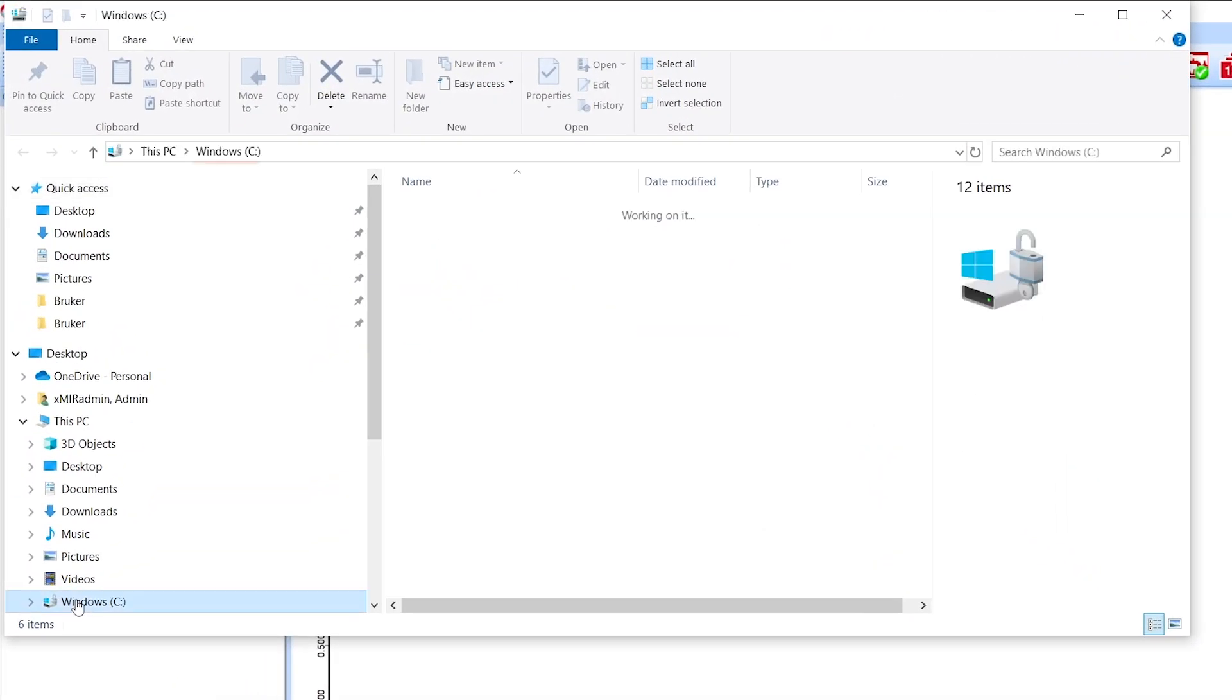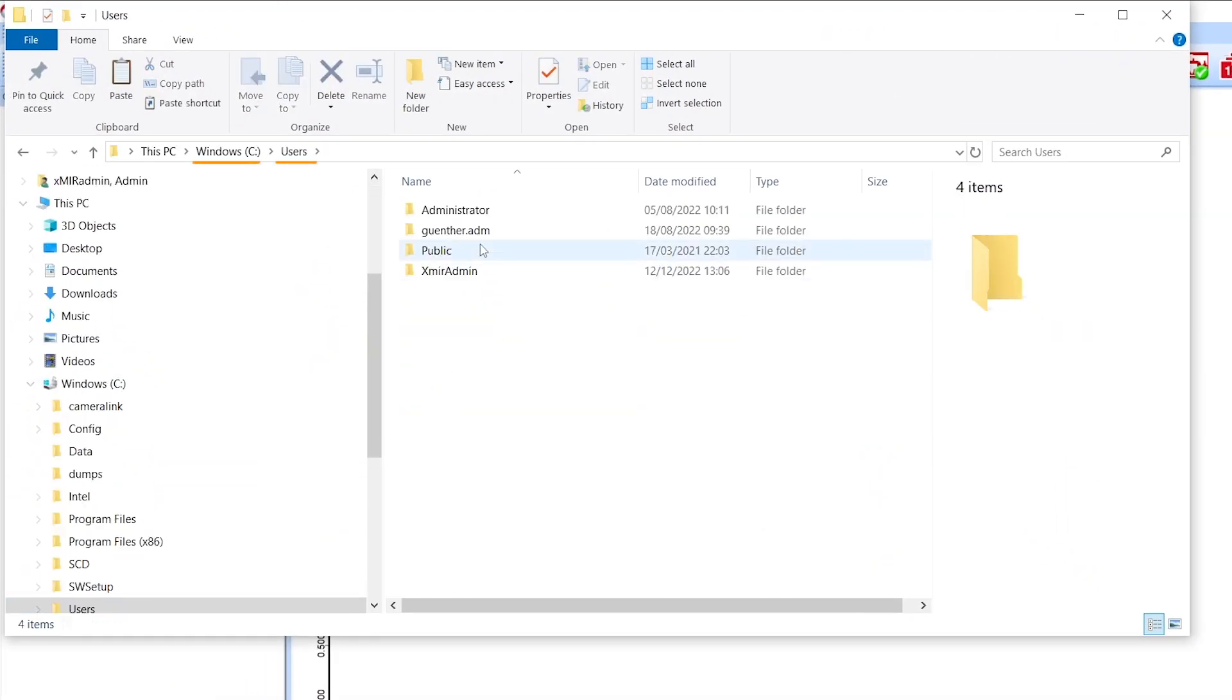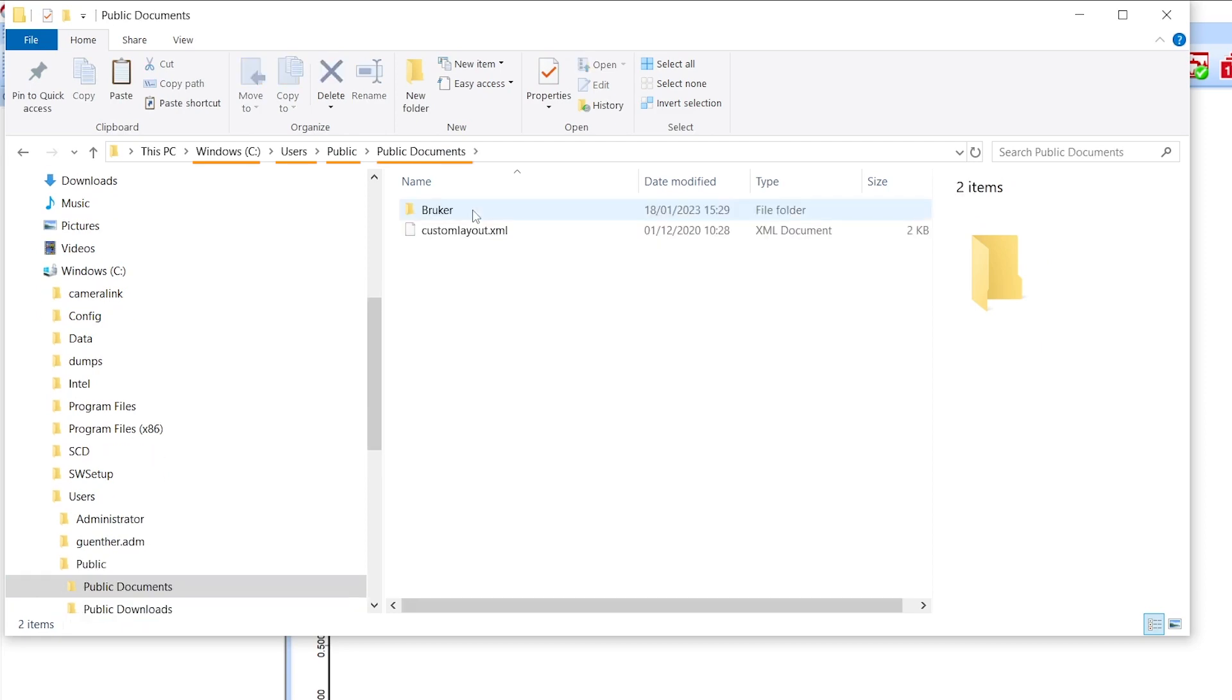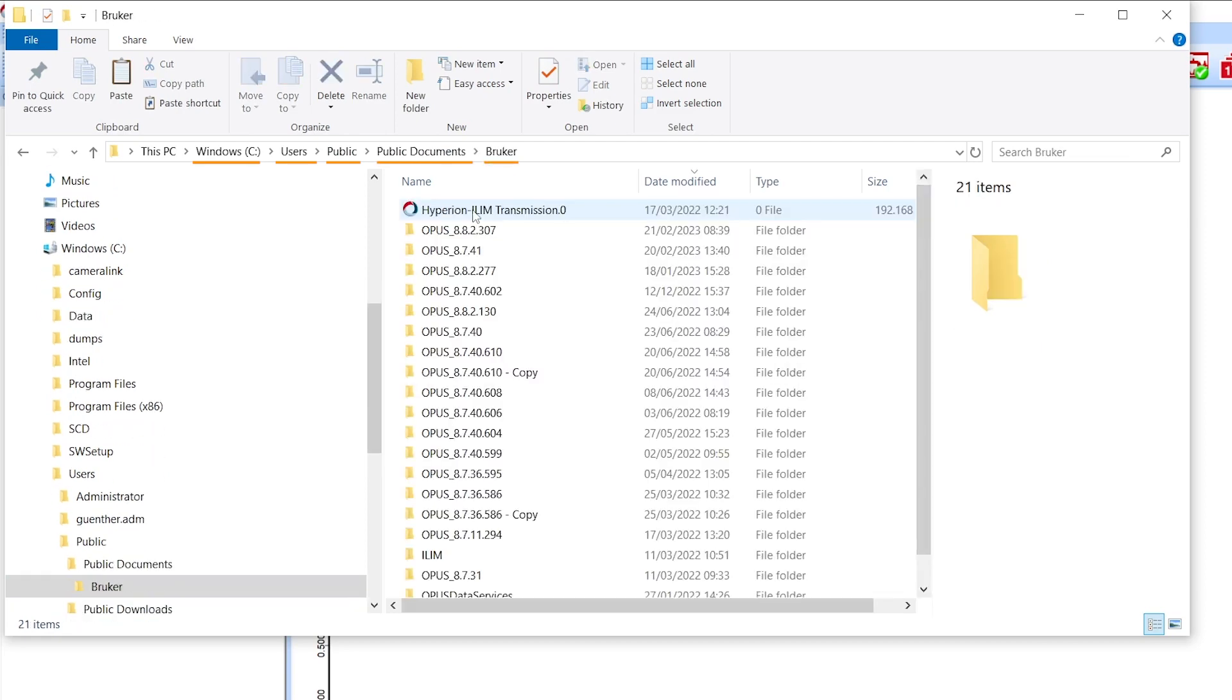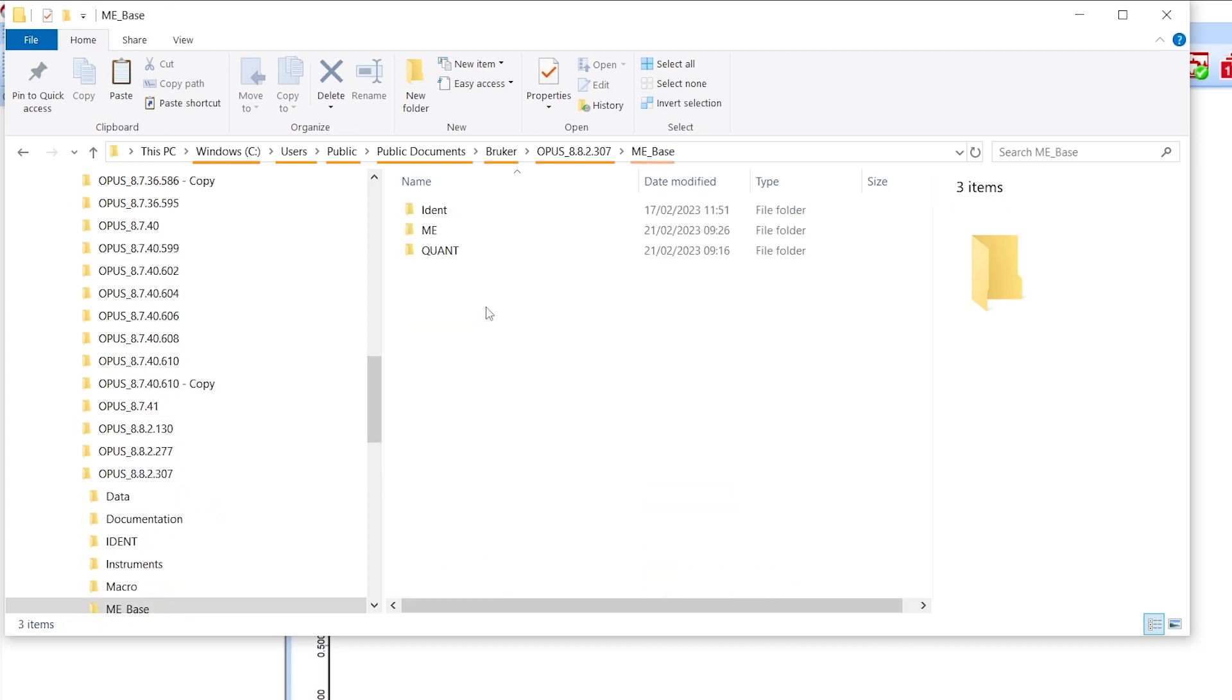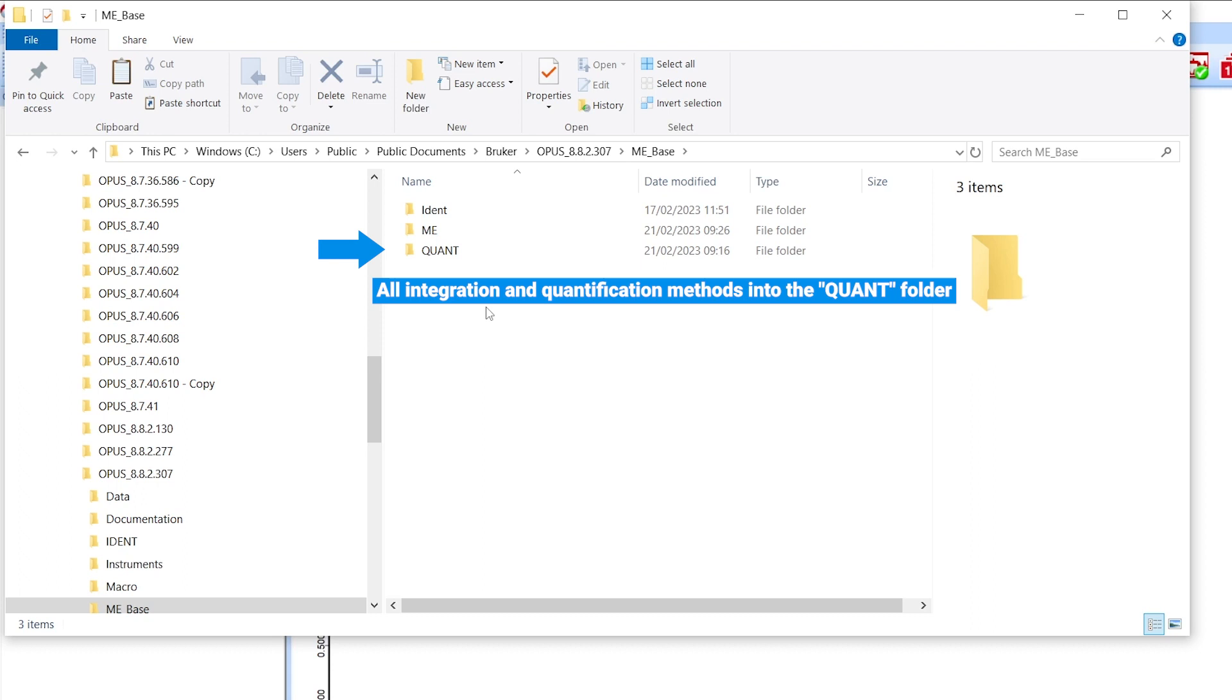Users, Public, Public Documents, Rooker, your latest Opus version and into the folder MEBASE. Put all required IDENT or quick compare methods into the IDENT folder and all integration and quant methods into the quant folder.